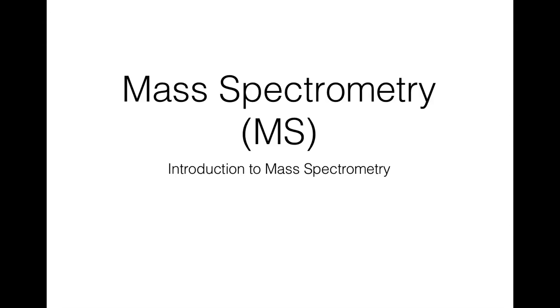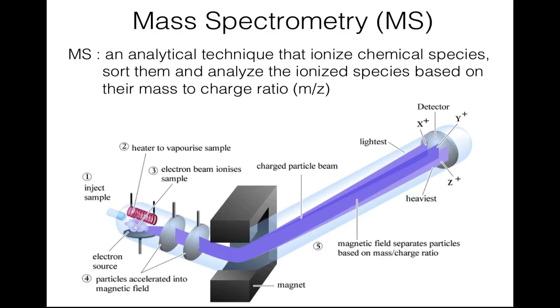In this experiment, we will review the mass spectrometry technique for analyzing unknown organic compounds. Mass spectrometry is a powerful analytical technique used to quantify known materials, to identify unknown compounds within a sample, and to elucidate the structure and chemical properties of different molecules. Mass spectrometry analyzes molecules and particles according to mass. A mass spectrometer has an injection port, an ionizer, an analyzer, and a detector.